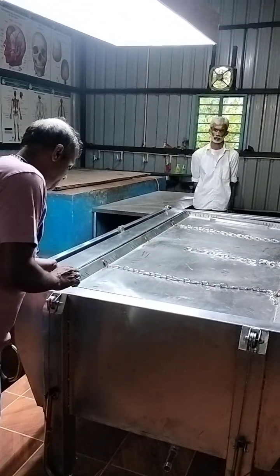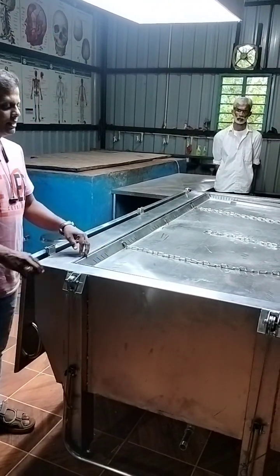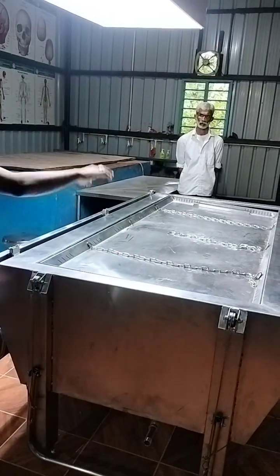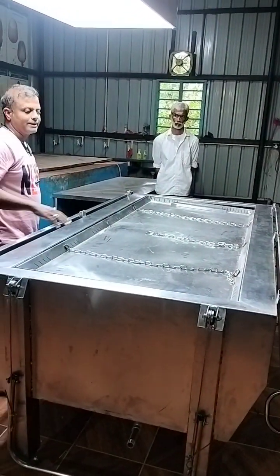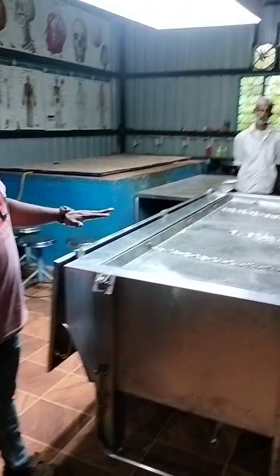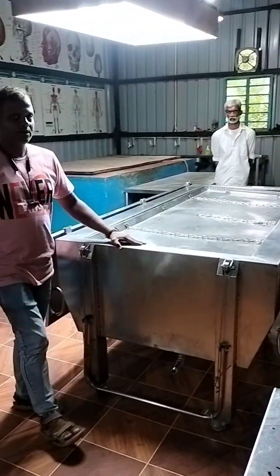Then you have to disconnect the cable system from the bottom and then you are ready. You can take this out and someone can go inside and clean it completely. So this is having both — cadaver storage table as well as dissection table — two in one.